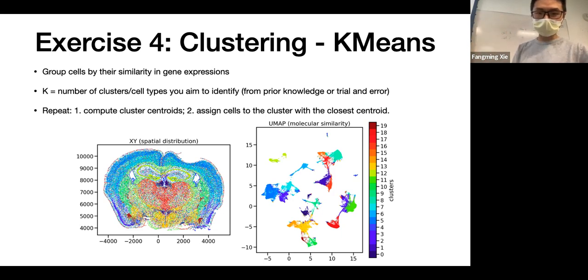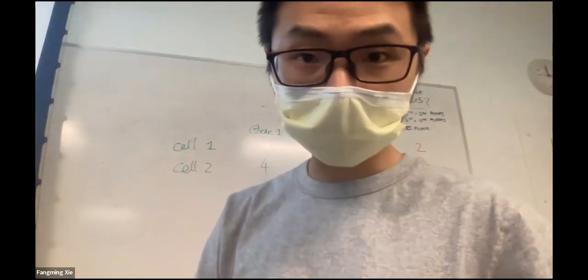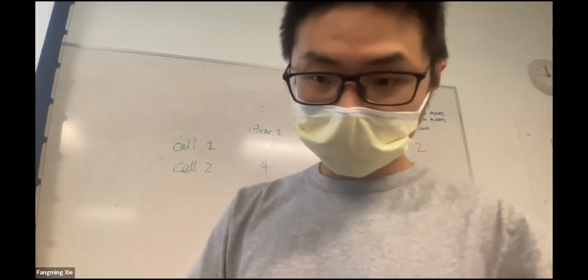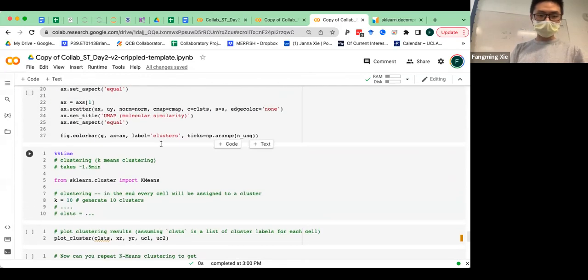But before that, let me show you how to do it on a demo data, a much simpler one. Oops. Did I stop share? Yes. Okay. So k-means, how do we do that?